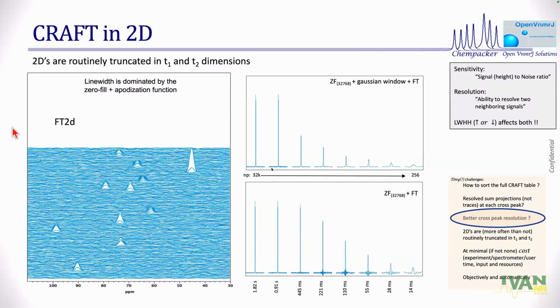That's what we typically have been doing when we have a 64 increment and the peak is broad. We go back to the lab and run 128 increments. Or we go back and set 64 increments, but sample non-uniformly, do a 50% sampling density, and give me equivalent to T1 max of 128. I doubled my resolution, I doubled my line width, whatever you want to call it.